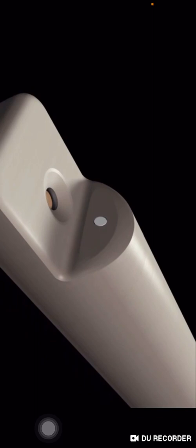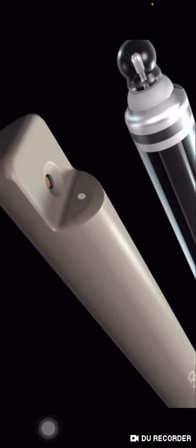However, just like glass sensors, ISFET sensors also need a stable reference potential. The potential that forms at the ISFET is accurately measured against the reference system, which is also protected from the measured solution by a so-called junction.